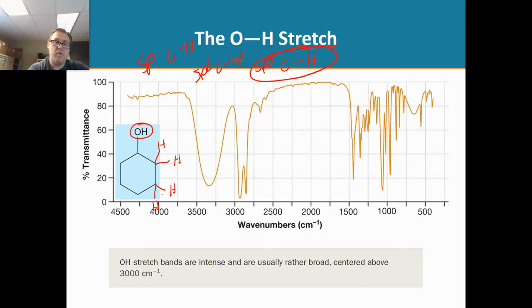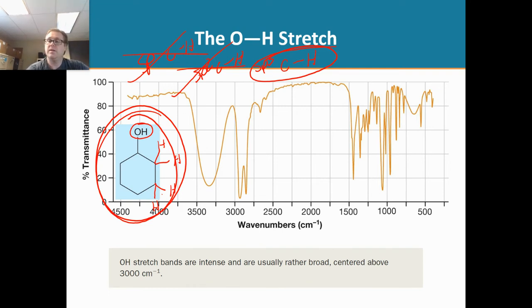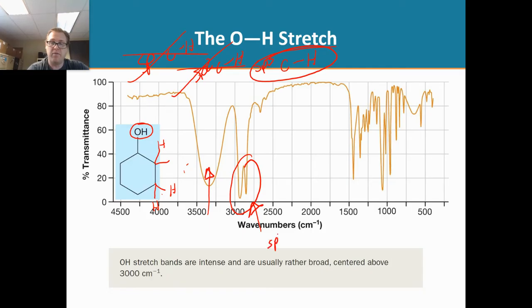So when we look at this molecule, there's clearly no sp2 and no sp. So very confidently, I can say this peak right here is the OH. These right here are the sp3 carbon-hydrogen stretches. Now do I worry about those? Nope. I don't. I found the big pieces, the big ones.